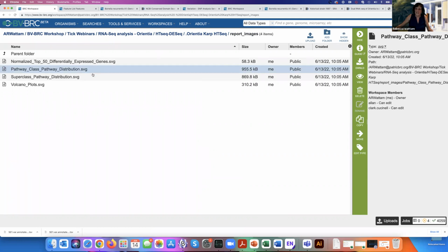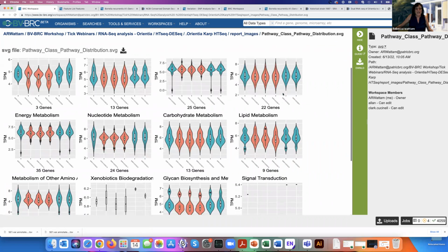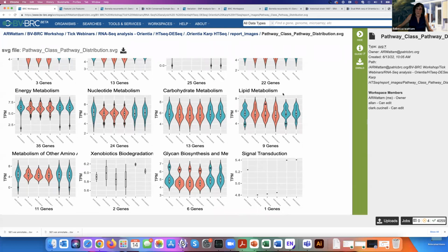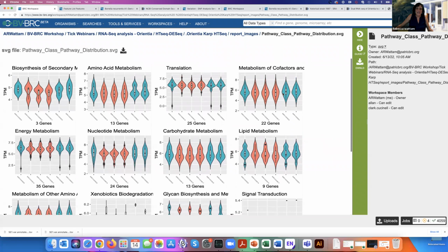We also look to see, are there any differences in genes that are known to be in pathways? So we can click on that. Red are for the CARP, the greenish ones are for the UT176. So it gives you a standard violin plot of those. And, you know, granted, when you look at this, nothing screams to you, oh my gosh, I have my Nature paper.